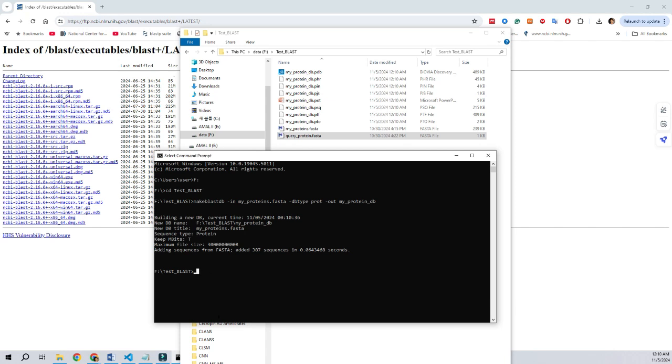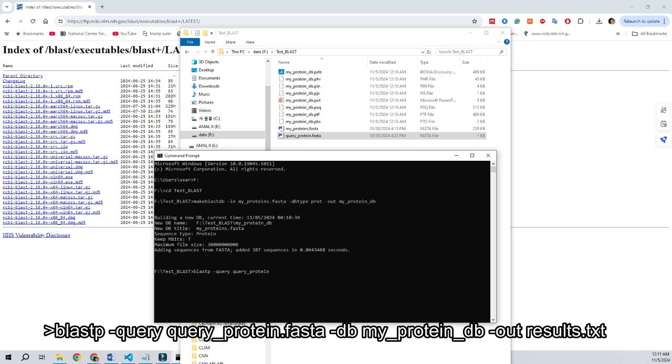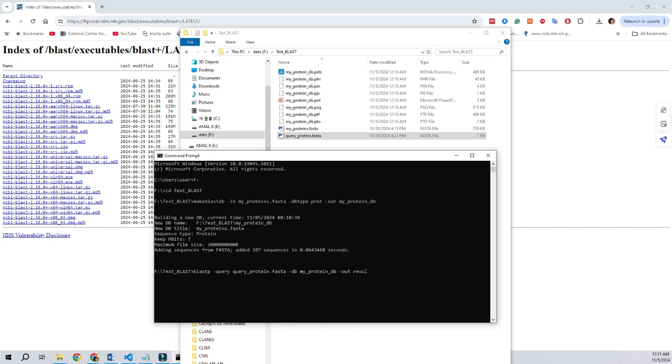At this moment, we can copy the query sequence into the same folder in FASTA format, and we can run blastp query on the command. And here, my query input or protein sequence is query_protein.fasta, and I'm using the myprotein database that I have created in the earlier step. And once you execute this command inside the command prompt, we will get our result in text format.